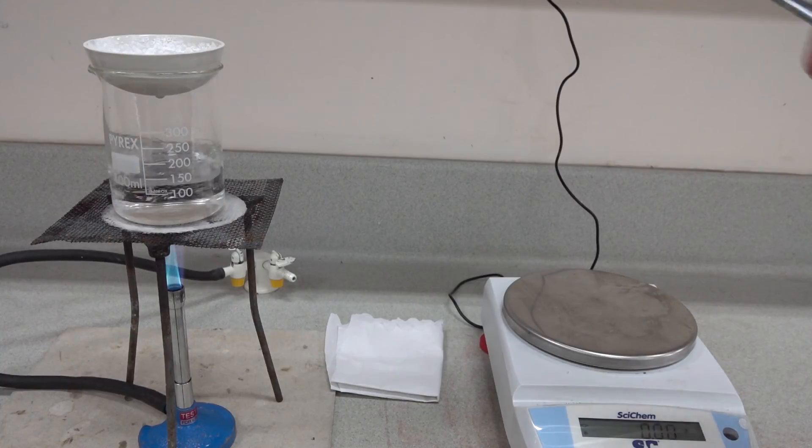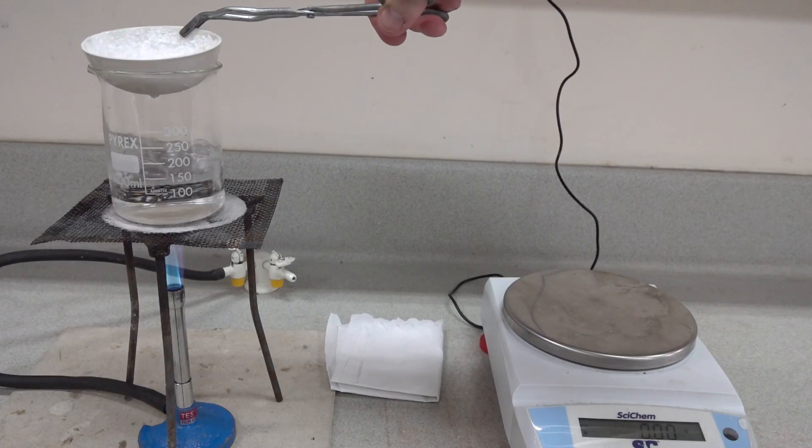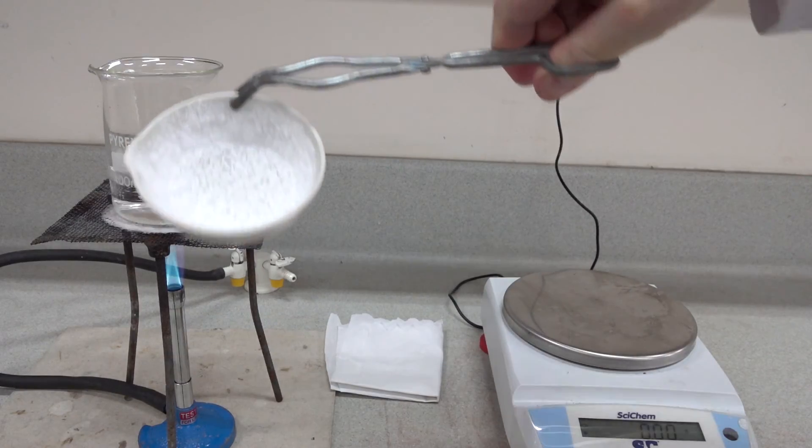Here we have an evaporating basin where we've been evaporating a saturated solution of potassium nitrate, and that is now evaporated to dryness.